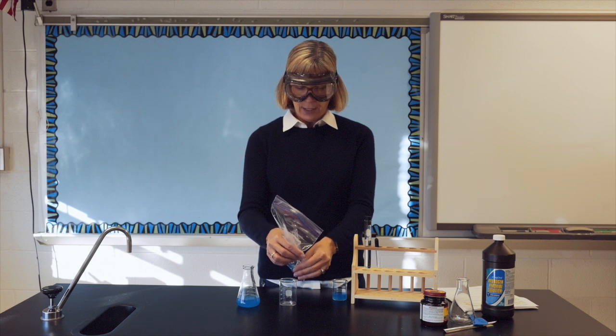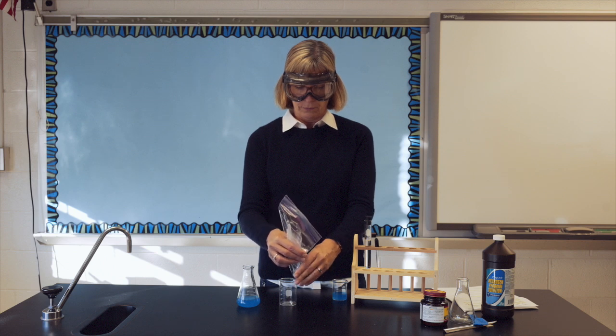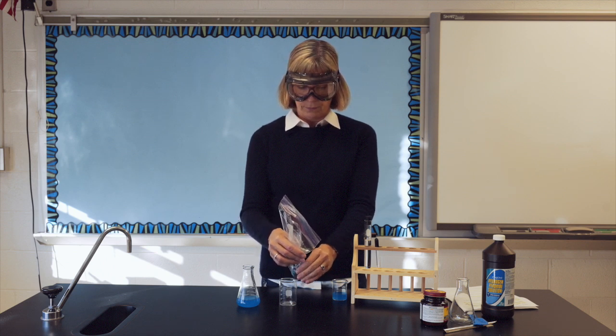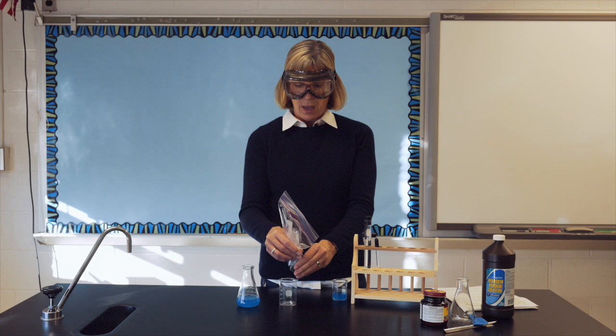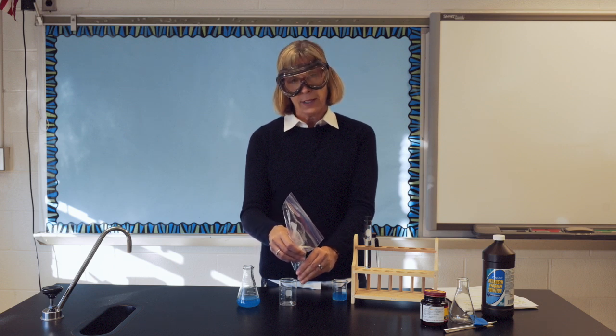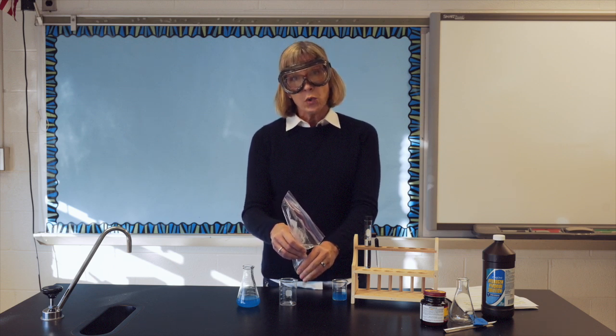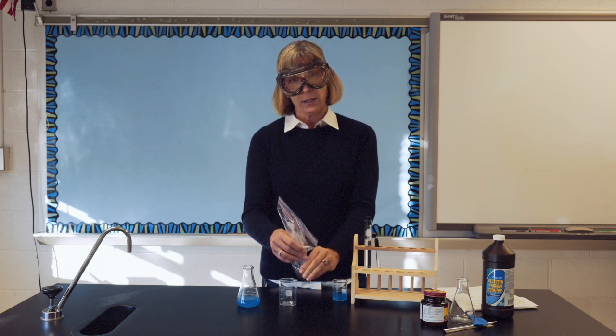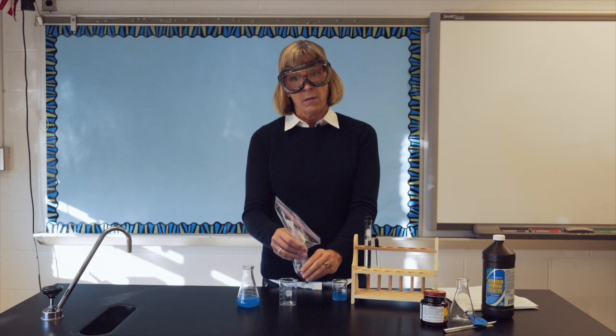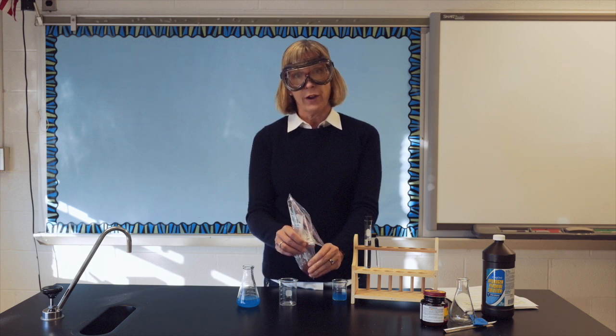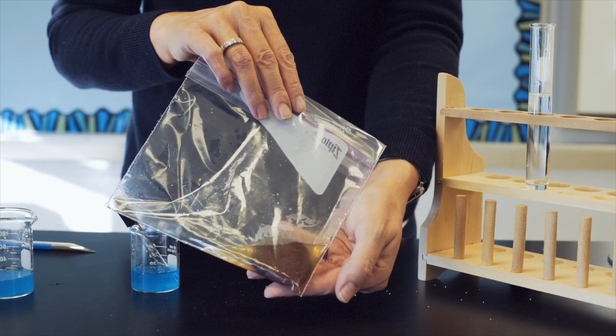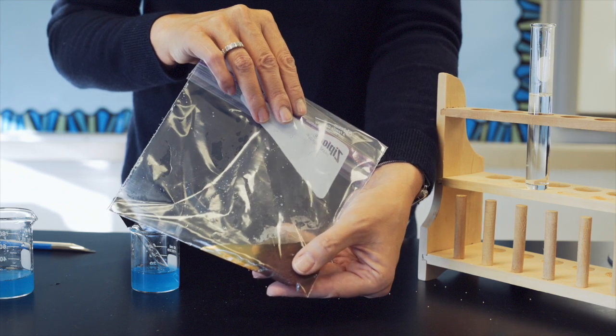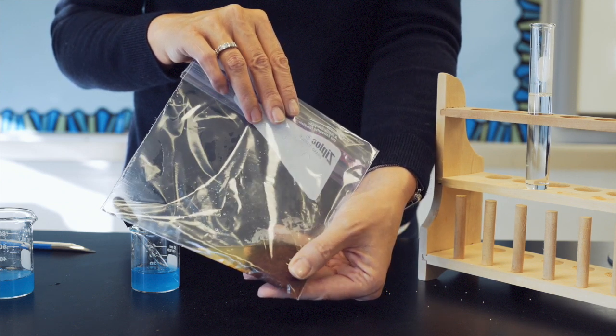These are then thoroughly mixed together. After a few seconds of mixing, a noticeable temperature change takes place in the steel wool. My fingers are getting very warm. In addition, you can see a color change taking place not only in the steel wool, but also in the liquid copper sulfate.